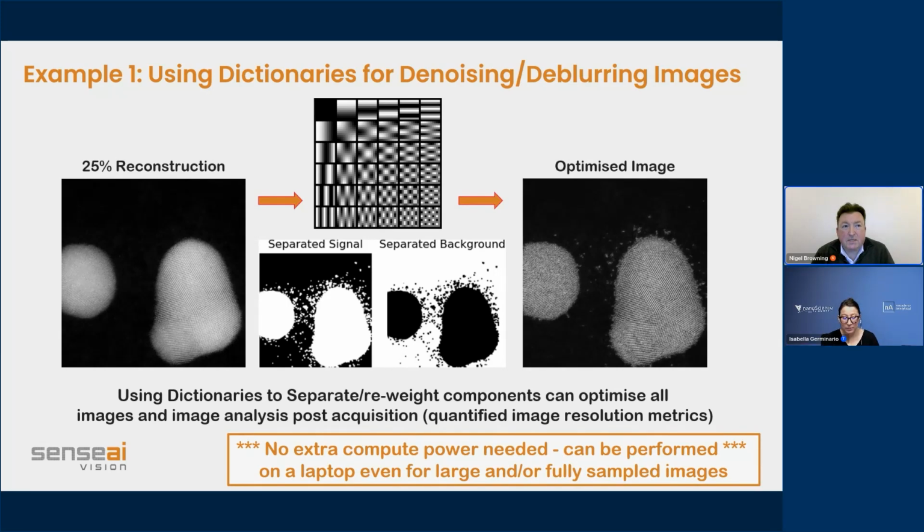So diffraction data is already very, very sparse. In TEM diffraction, it's all very sparse data. In 4D STEM, of course, it's not a sparse data set. 4D STEM is essentially a diffraction pattern that's an image. And there we already know that we can in-paint missing patterns and we can go through that process. So that's not too much of a problem to go through.